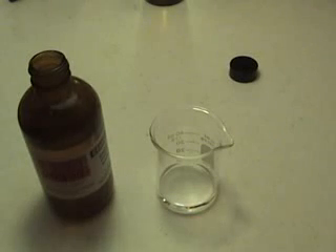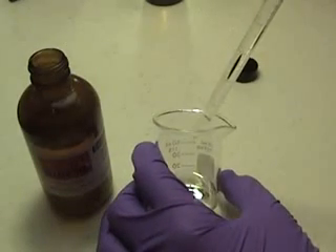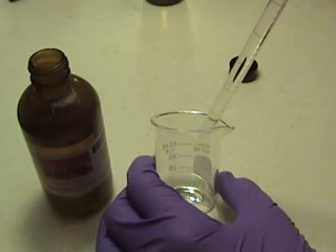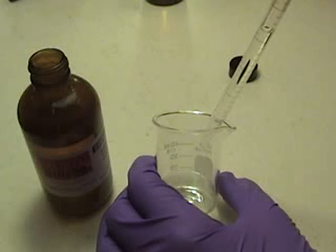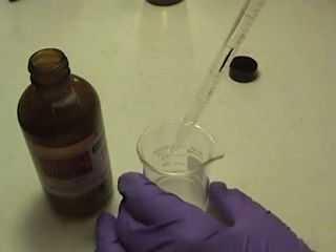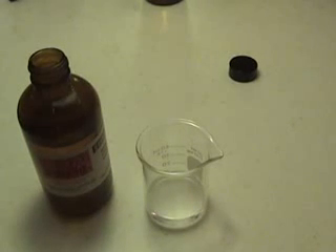I have now measured out 4 cc's of the sebacoyl chloride. I am going to take the beaker and carefully, slowly drip the sebacoyl chloride down the side. After you have a couple cc's in there, you can let the rest of it out fairly quickly. You want to make sure you put it down very carefully and make sure the chemicals do not mix or the experiment will be ruined.